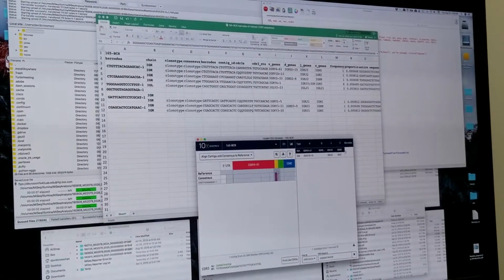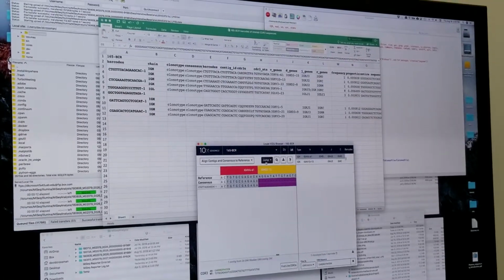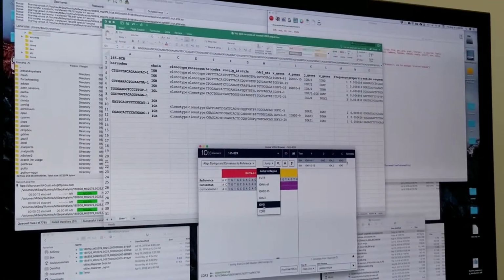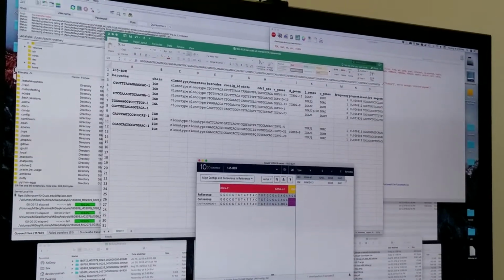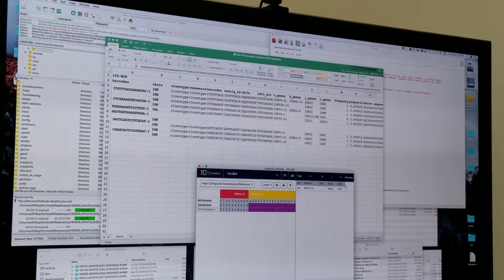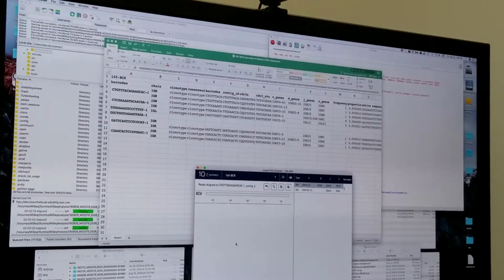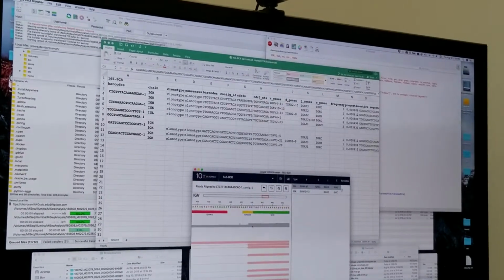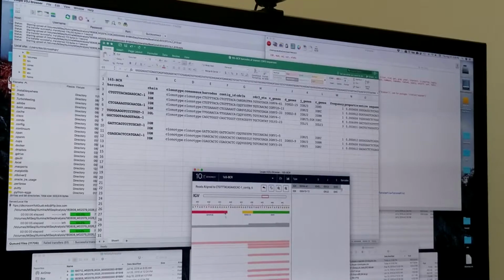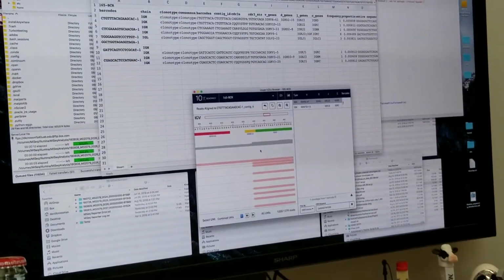The color coding is not... Well, I think that's it. I think the green should be CDR3, right? That's the D. Well, both. I want to go combined from the V to the J. Okay, so let's just see. Maybe the J chain is missing or something. Yeah, I want to go from here to D there. D is next, and then this J is where I want to be. That's where the CDR3 sits right here.